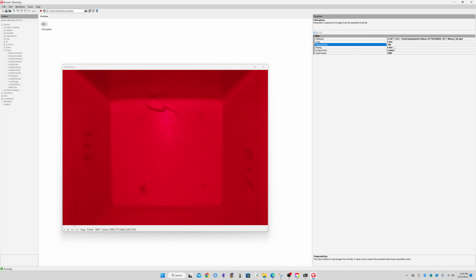Right, so if I change this again to 1000, that would speed this up. Now you can fiddle around with this. It depends on what type of a GPU you have, and quite frankly, I wouldn't go above anything like 500.